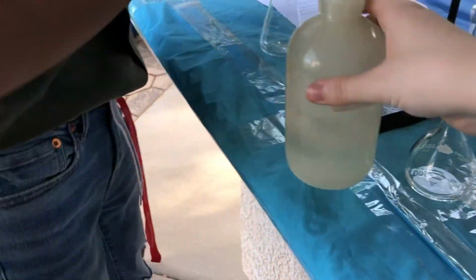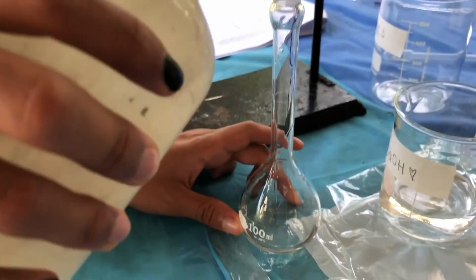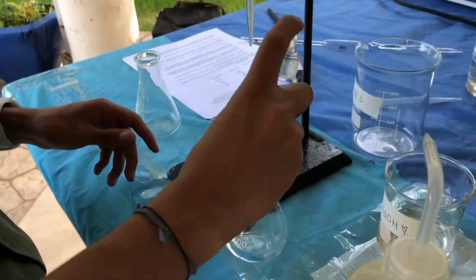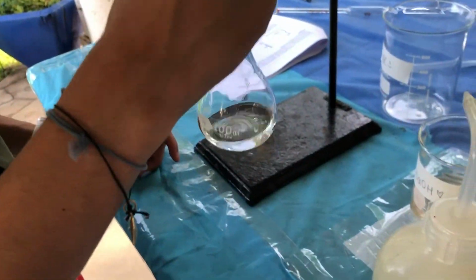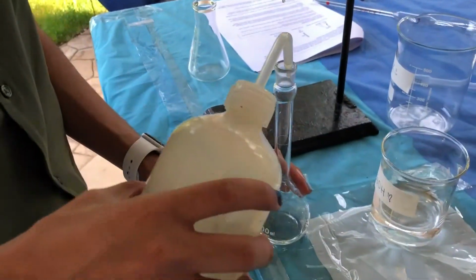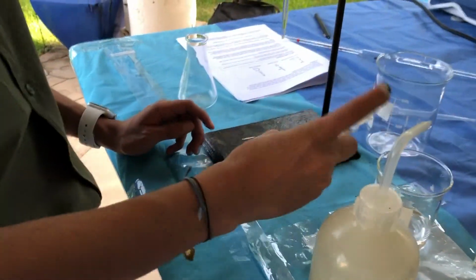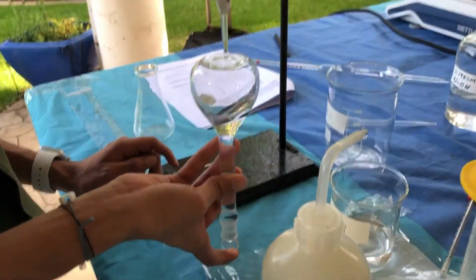Then we're going to add enough DI water to make it a 100 milliliter solution. So we're going to do this gradually. We want to get it up to there, but we're going to add a little DI water at a time. Every time we put a little bit in, we're going to invert it, make sure it's a homogeneous solution. Invert it, let it mix, do that a few times, and then we're going to add more DI water. We're going to continue doing this until it's at 100 milliliters.